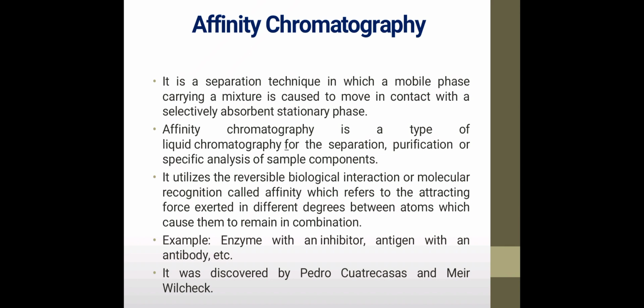Affinity chromatography is a separation technique in which a mobile phase carrying a mixture is caused to move in contact with a selectively absorbent stationary phase. This chromatographic technique involves the usage of a stationary phase as well as a mobile phase. In the mobile phase, we have to add the mixture in which the analyte has to be separated.